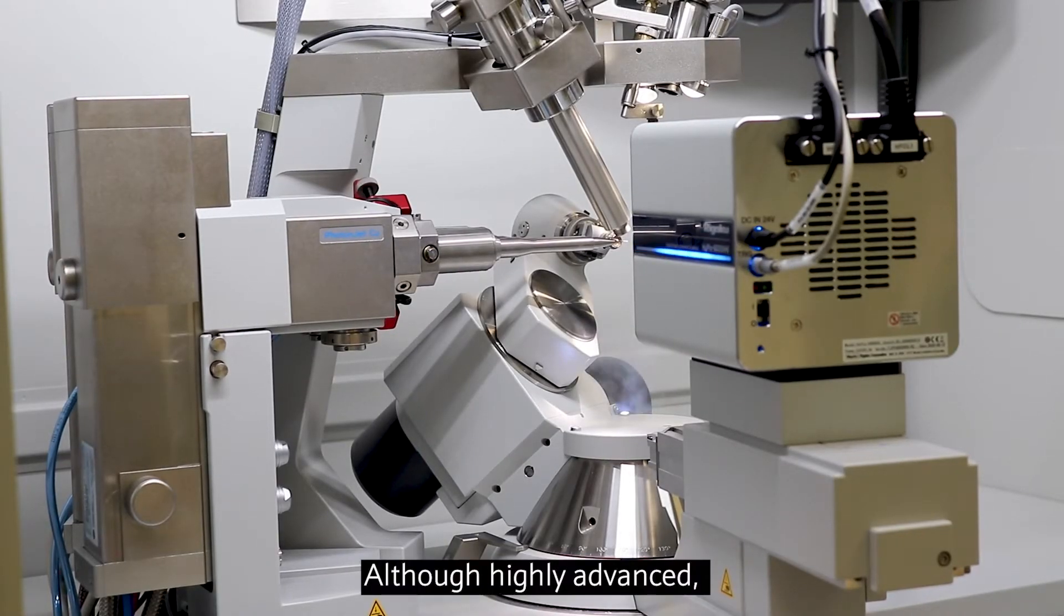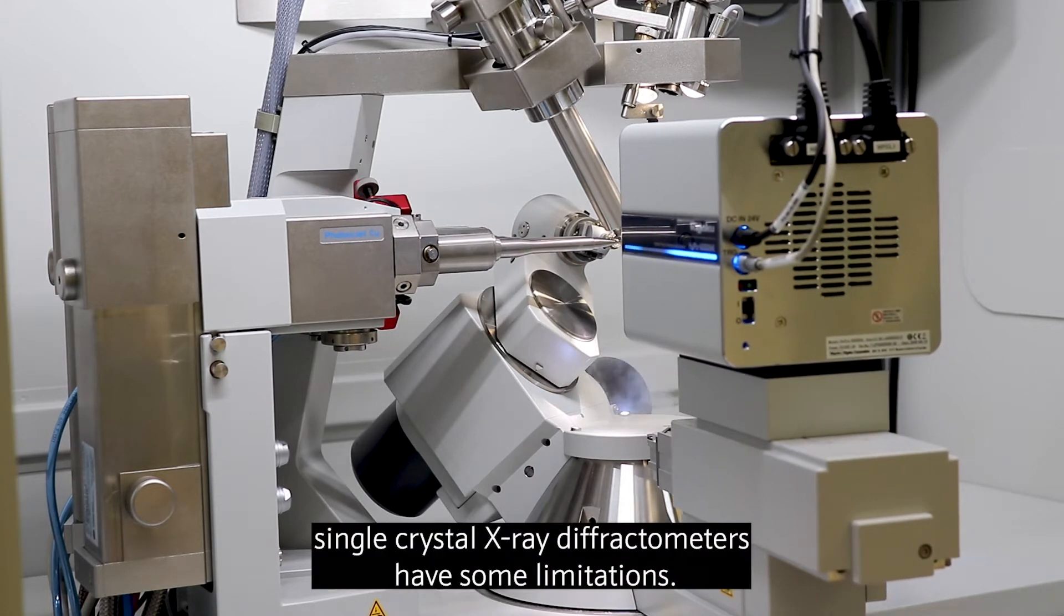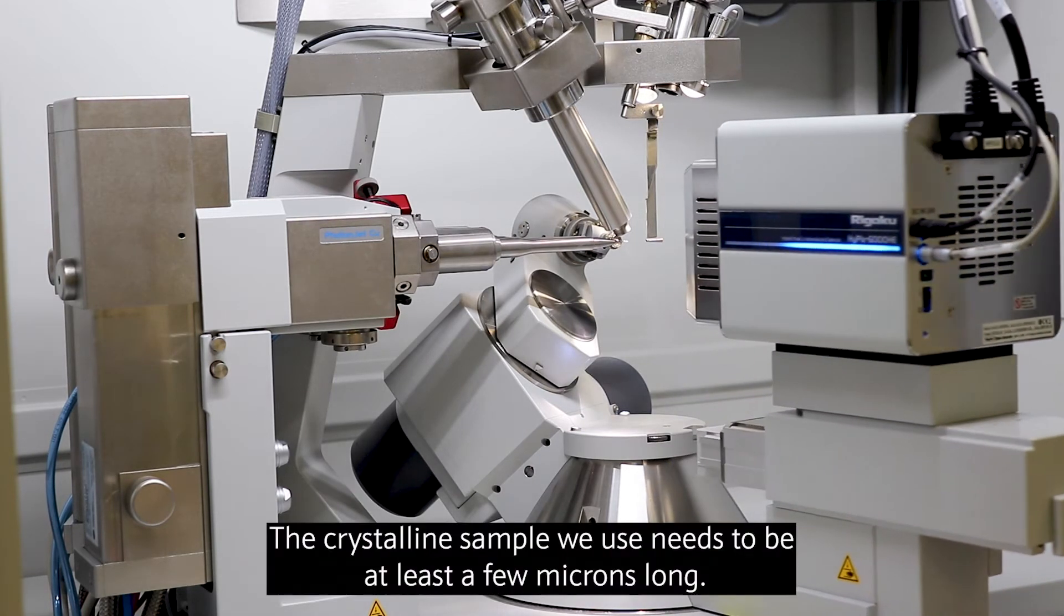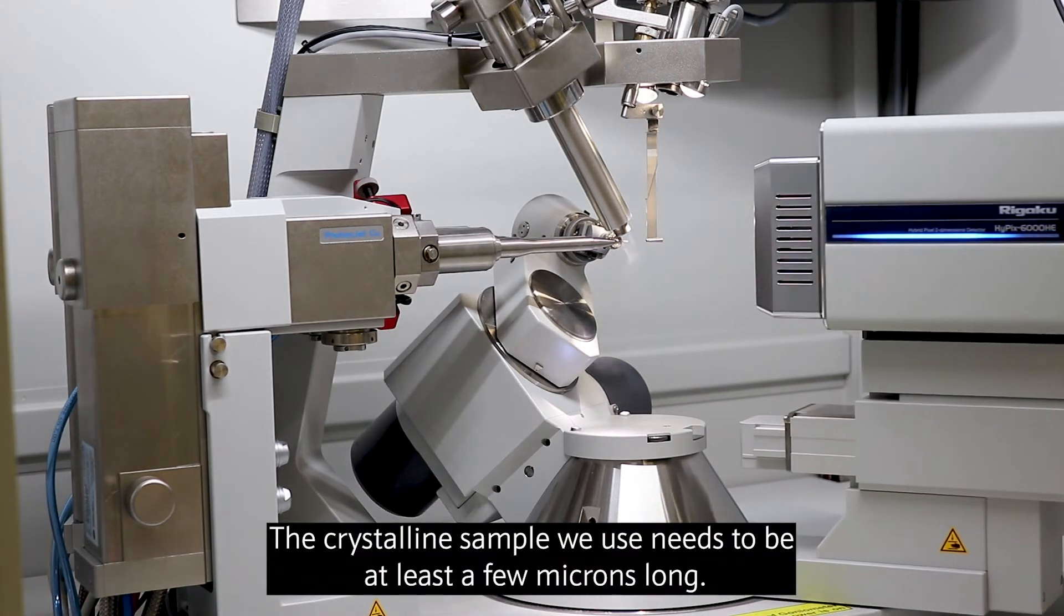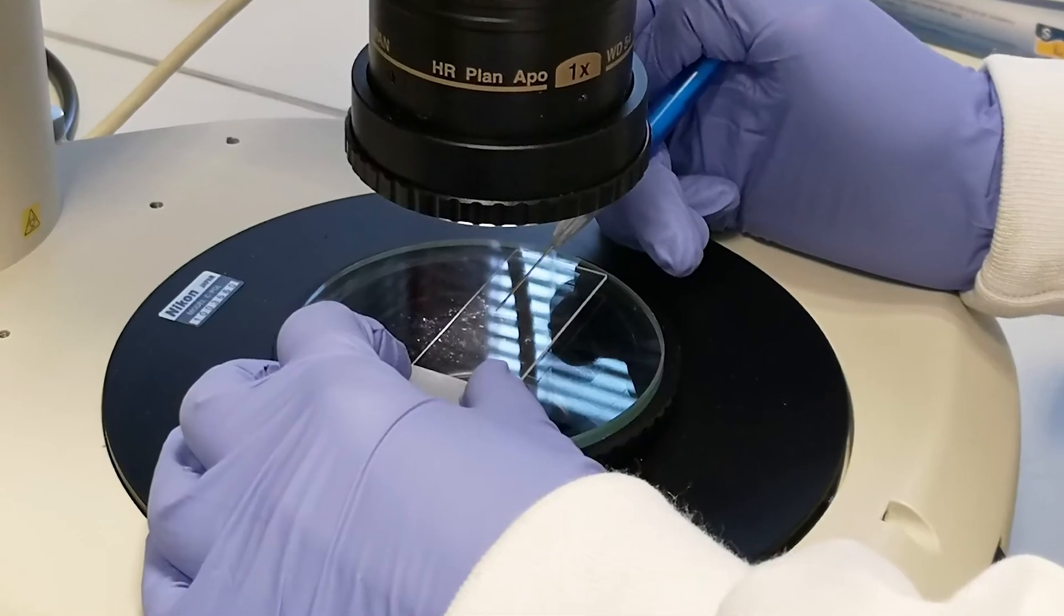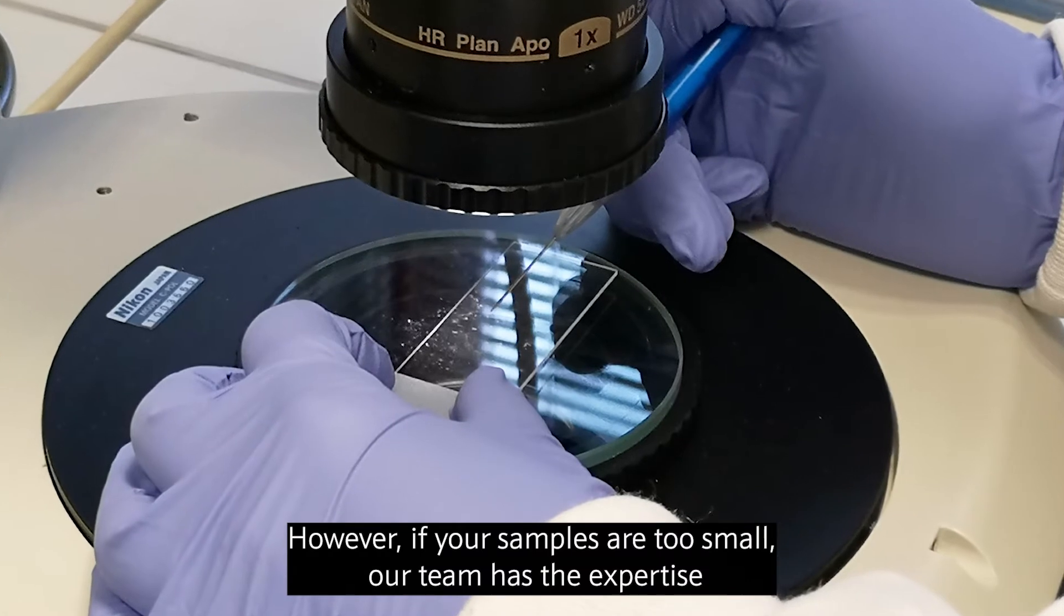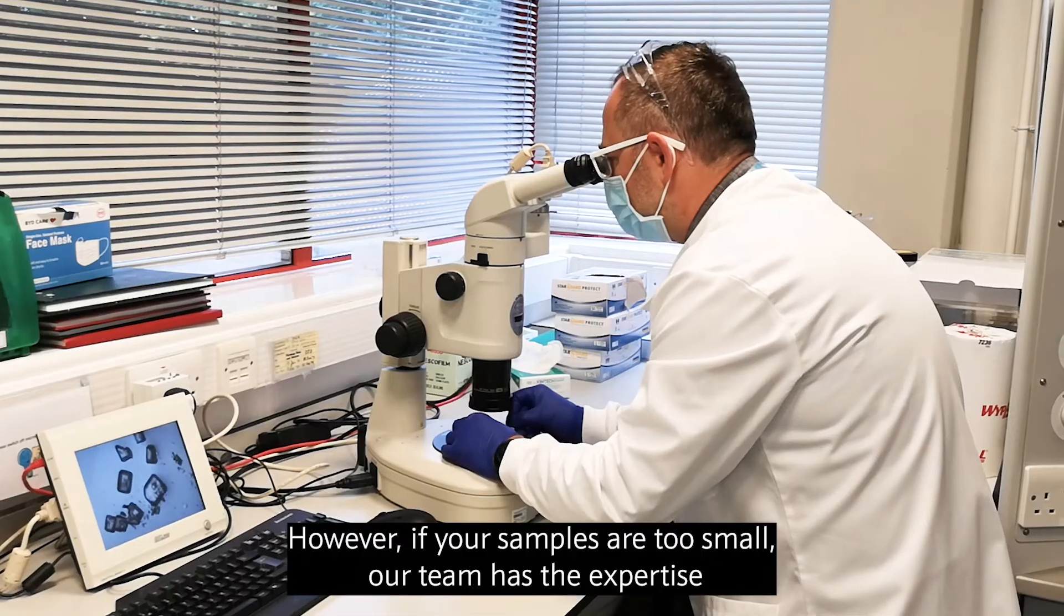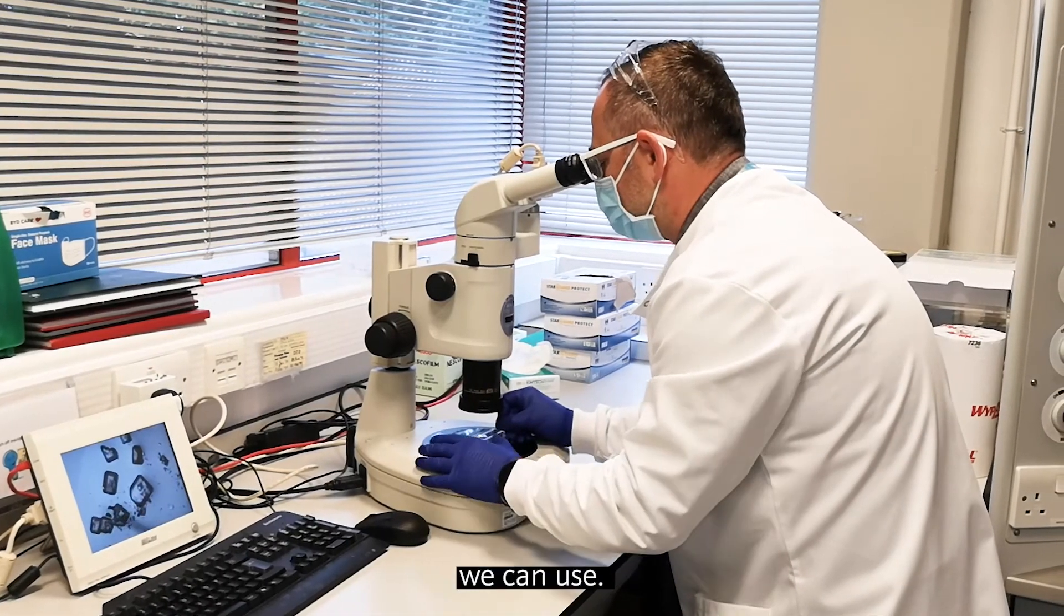Although highly advanced, single crystal x-ray diffractometers have some limitations. The crystalline sample we use needs to be at least a few microns long. However, if your samples are too small, our team has the expertise to grow larger crystals we can use.